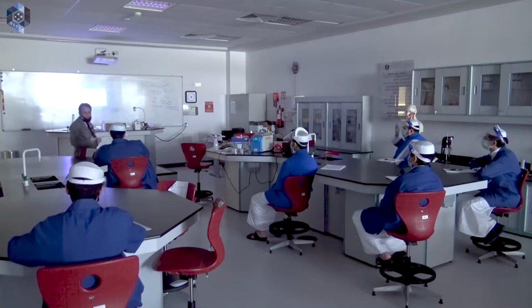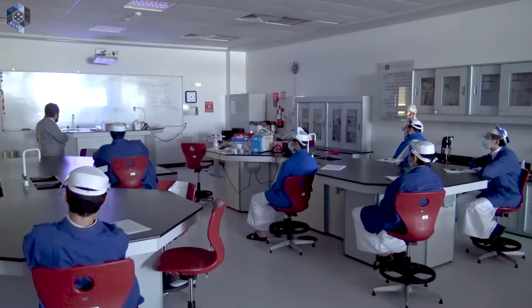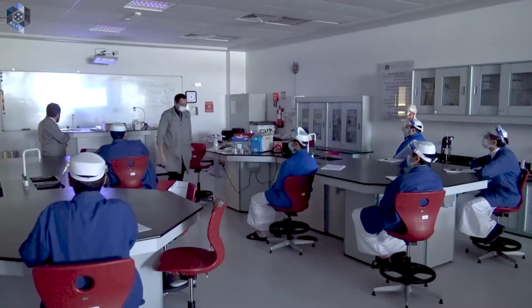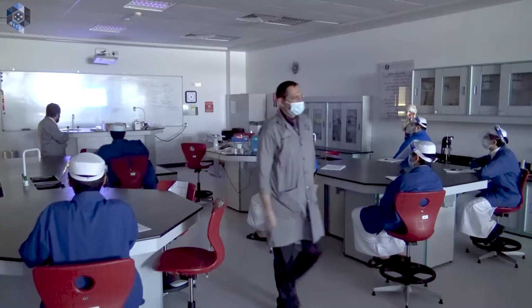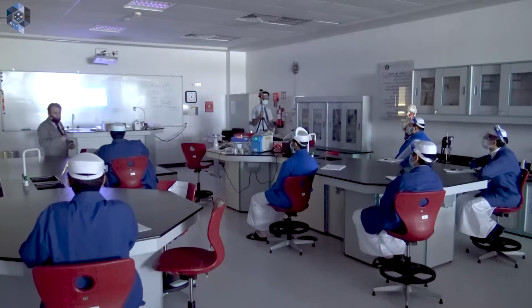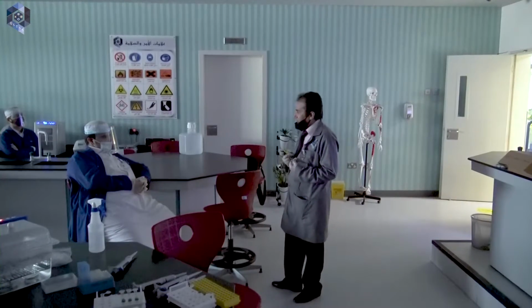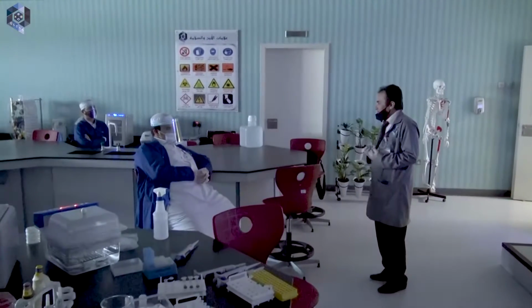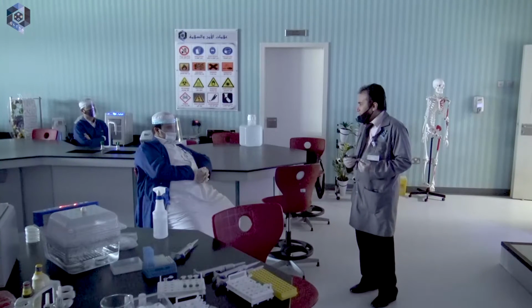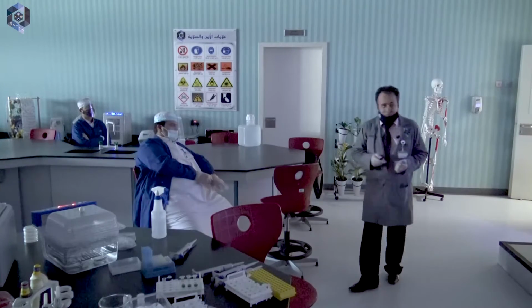Now, why did these bands migrate less, moving a shorter distance from the well than these two separated bands? What do you think, Marie? Why did this band move a little distance compared to this band? This is the well, this is our reference, okay? This band moved only this distance, while this band moved a bigger distance. Is this related to the size? When two individuals are making a race, who would move faster, the thin or the fat one? The thin one will move faster.